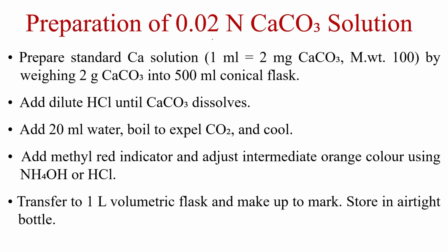Okay, so as I've told you, we have to standardize the prepared 0.02 normal EDTA solution using 0.02 normal calcium carbonate solution. This is a primary standard substance, so once prepared, we will know that it is 0.02 normal only. Calcium carbonate molecular weight is 100 gram.